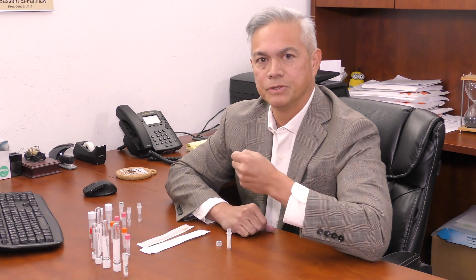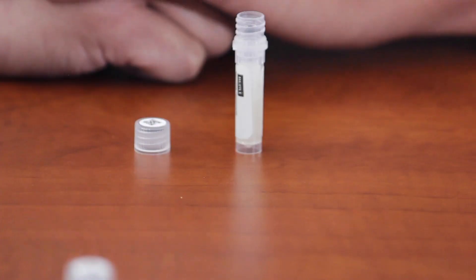If you've ever taken a saliva sample, you'll know that it's impossible to set the tube down on the table — you have to hold the sample tube in your hand the entire time that you're collecting the saliva sample. We designed iSwap to be spill-proof, so that even if you set the tube on the table and you happen to spill it, the chances of losing your sample are next to zero.